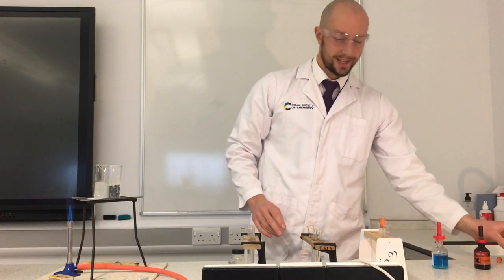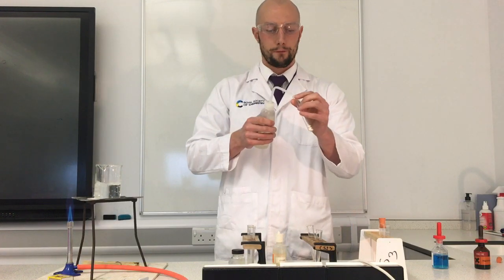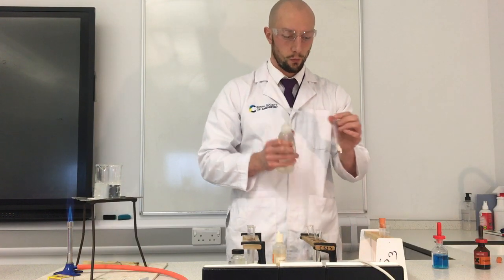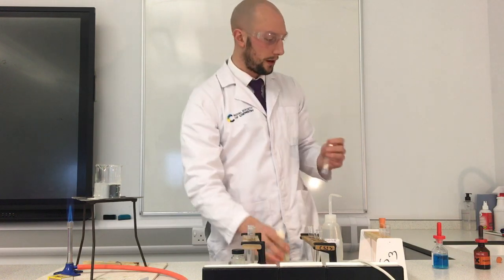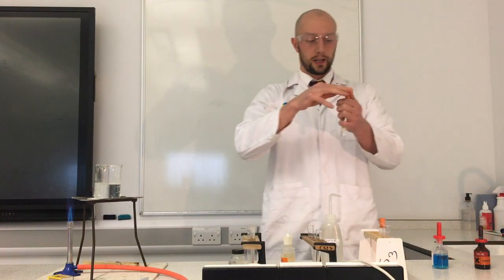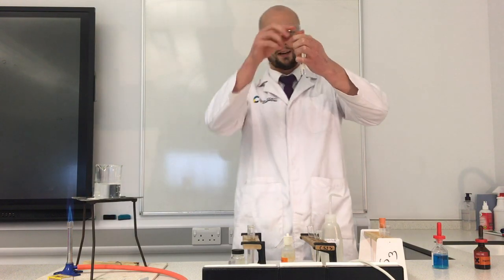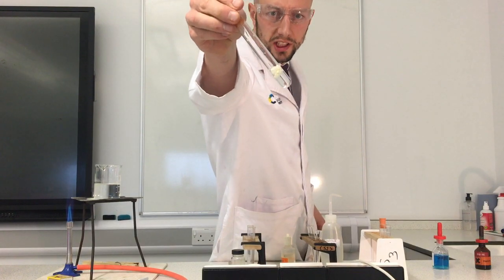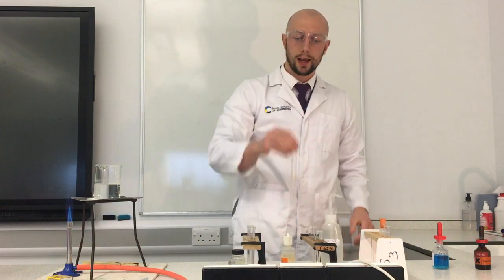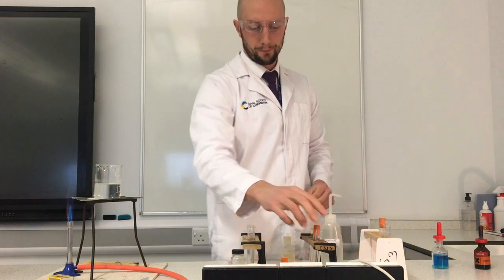My next test is to add some water and some ethanol and see if it's got fat in it. There's some water. There's some ethanol. I'm going to put my bung in and give it a good shake up. And let's have a look. All we can see is just rice cake floating in water and ethanol. It's not gone cloudy, which means it doesn't have any fat in the rice cake.